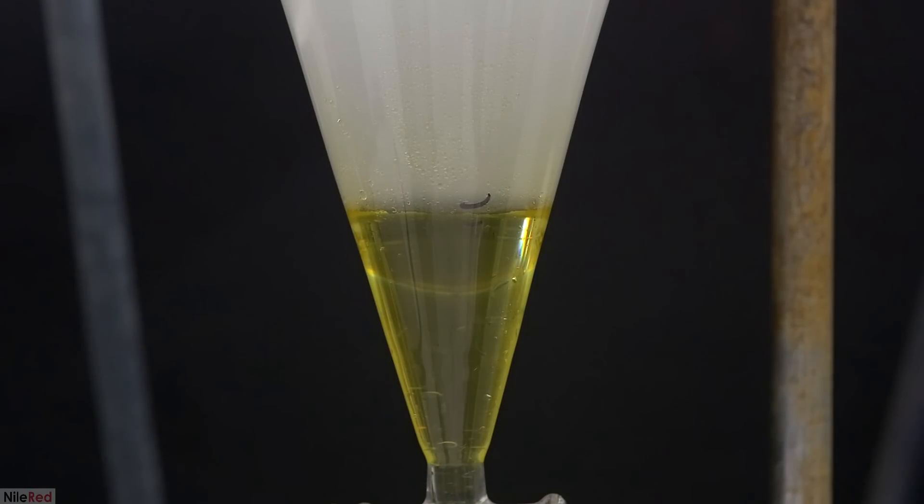I actually transferred the first distillate to a separatory funnel because I didn't expect there to be so much of it. When I take a look here, I can see that there's quite a bit of oil and I think this is actually the majority of the oil that I collected. After this initial oil came over, I think the rest of the distillation, which was something like 3 to 3.5 litres, only got trace amounts of oils and it's not really worth it.